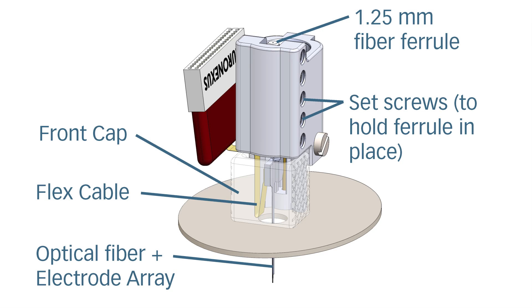To accommodate an optical fiber, the O-Drive utilizes a movable ferrule which is locked in place with hex screws. The hex screws must be loosened before any depth alteration of the probe.